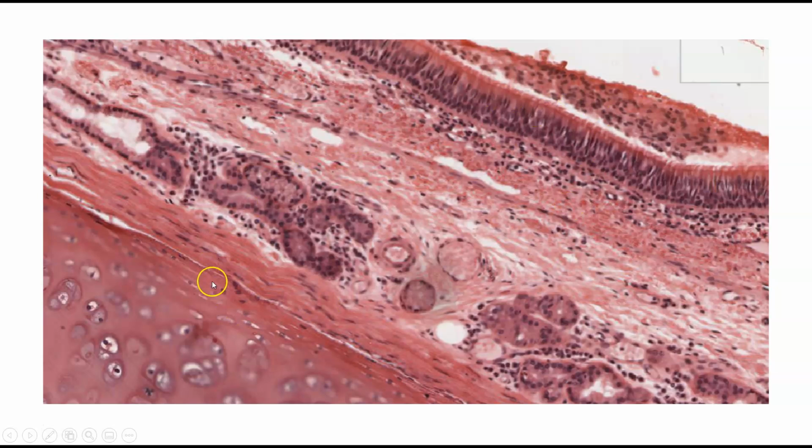This is a cut of the trachea. Over here, this would be the lumen out here, so this is where the actual air will be flowing. What you see right here is bullcrap. Our official name for it is artifacts, stuff that kind of just gets there in what would be open tubes when we cut open a person. So this is nothing. Don't worry about this. This wouldn't be here in a living individual. This would all be open air flowing through the middle of the trachea, aka the windpipe.